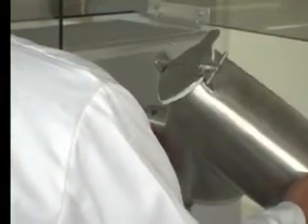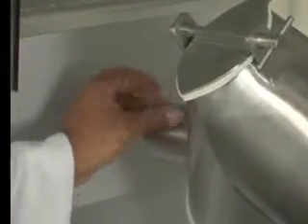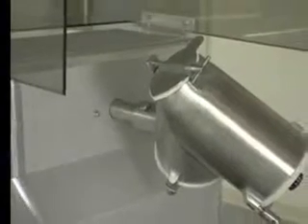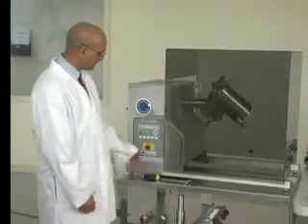Now we will install the V shell. Just slide it onto the shell drive shaft and make sure the bushing is aligned. Then put the bolt on and tighten the bolt with the wrench. We are ready to do the blending. This is the blender running with a V shell.